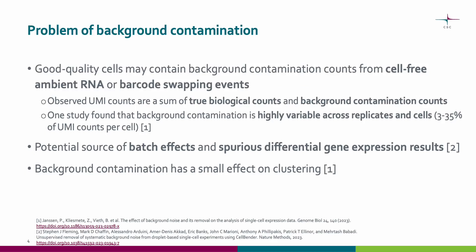We have learned how to filter out low quality cells, for example dead cells. However, estimated good quality cells may still contain background contamination counts from cell-free ambient RNA or barcode swapping events. Therefore, the observed UMI counts are actually a sum of true biological counts and background contamination counts. One study found that background contamination is highly variable across replicates in cells, and 3–35% of UMI counts per cell were from background contamination. This background contamination is a potential source of batch effects and spurious differential gene expression results. On the other hand, background contamination has a small effect on clustering.